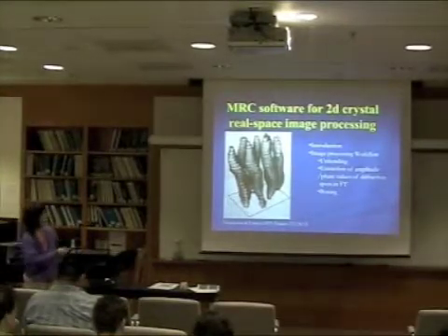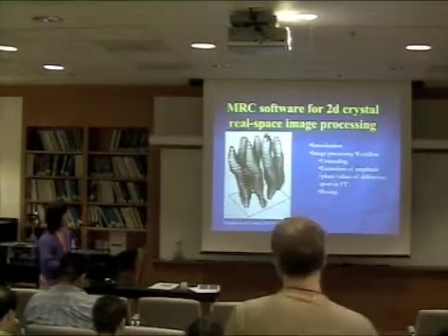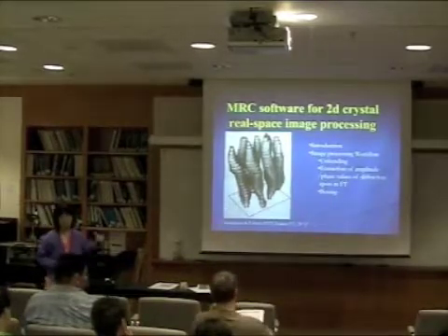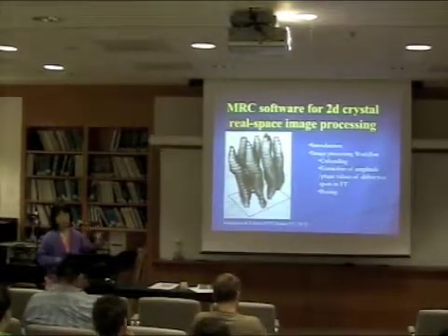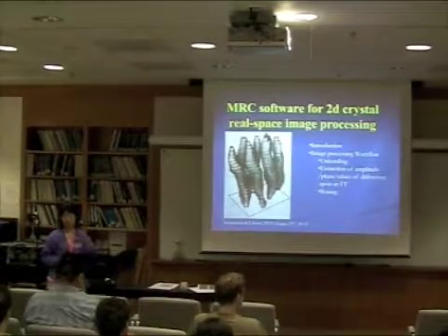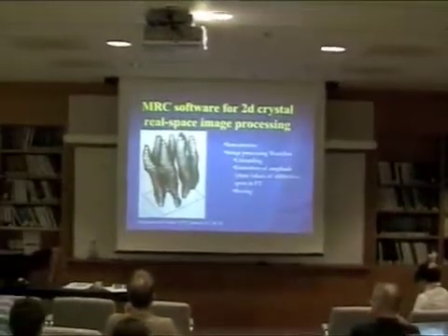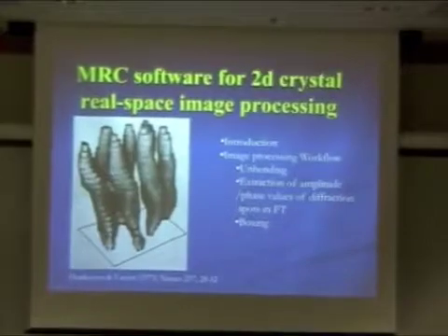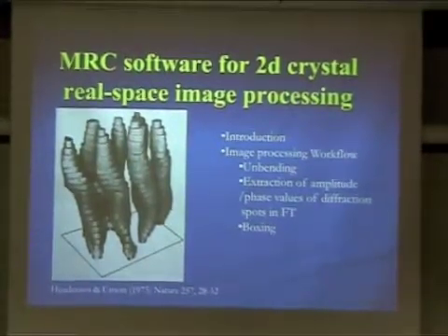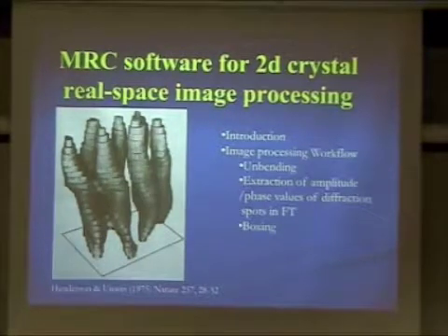So I'm going to start with introductions with what's inside the MRC package, and then going through a few crucial steps in the image processing of one single image. If you went to the computing workshop already, we've basically gone through the main part of the processing already. So this will be the second time. So I'll go a little faster, but try to concentrate on the part that can go around so that you can see what happened.